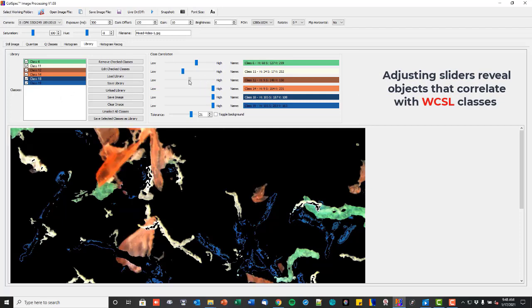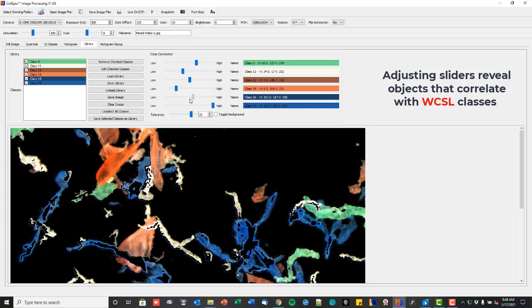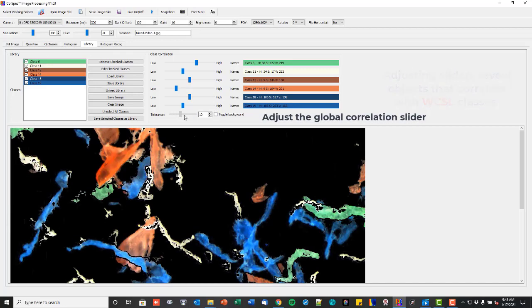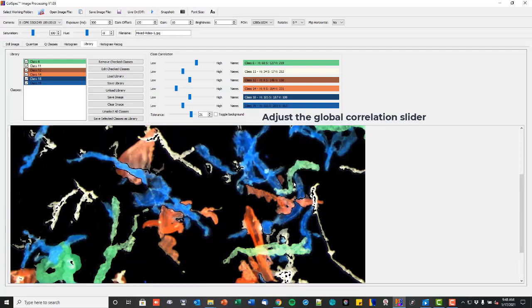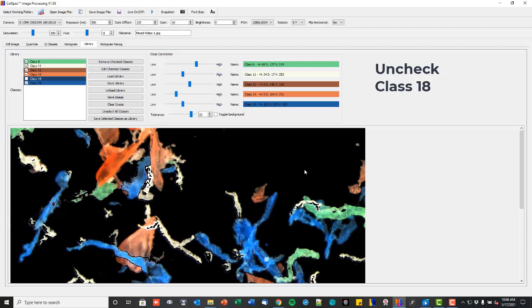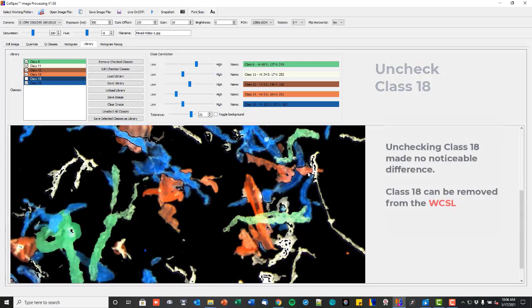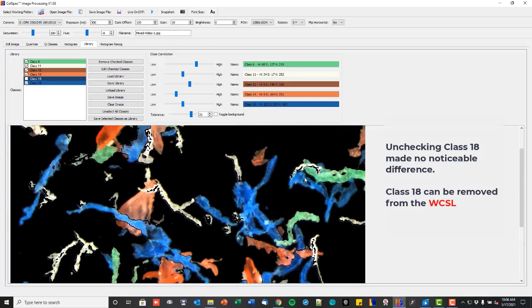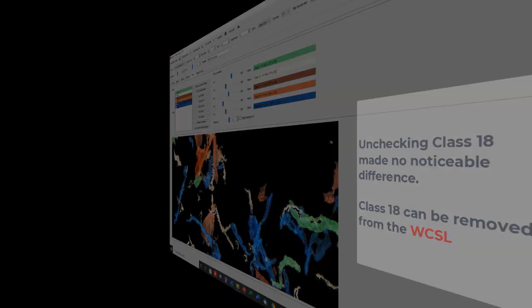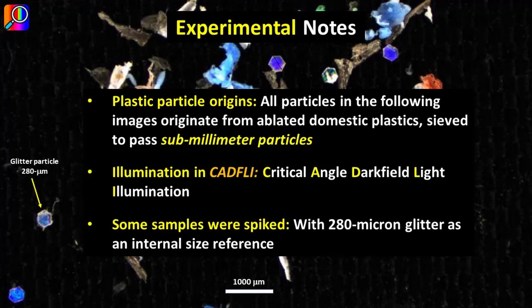To reveal objects that correlate with library classes, adjust the sliders. The Tolerance slider makes global adjustments. Unchecking Class 18 makes no noticeable difference to correlated classes; therefore, Class 18 can be removed from the library.